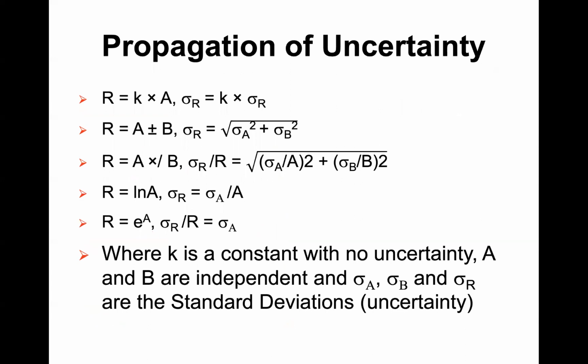And here, we will look at uncertainties. All measurements have uncertainty, as we mentioned earlier. For example, you record a value like 1.200 gram, plus or minus. This is uncertainty. For all measurements, you will have some uncertainty associated. During calculations, this uncertainty can be scaled up or scaled down depending on what type of calculation you do.